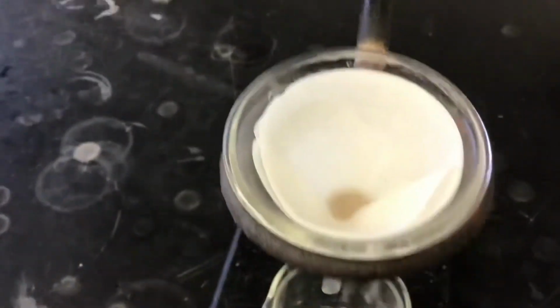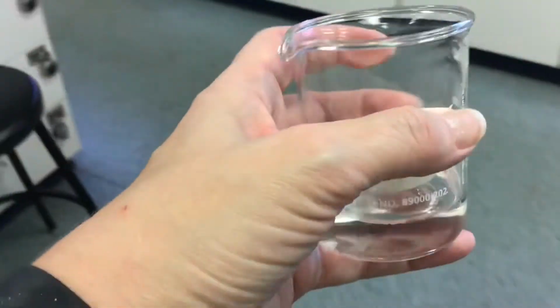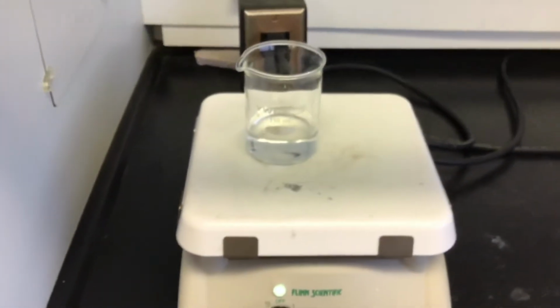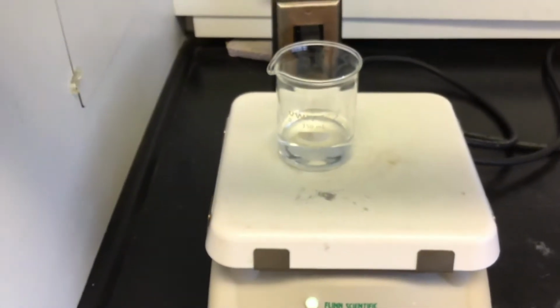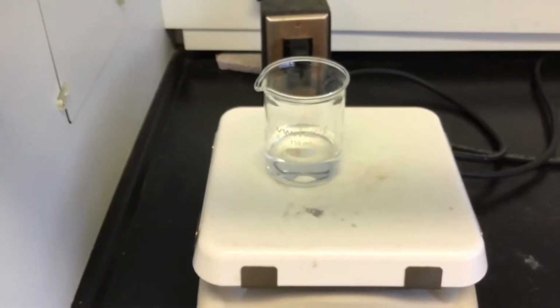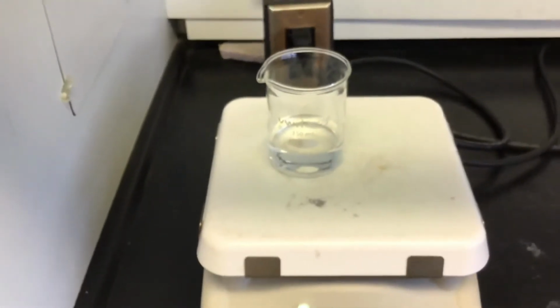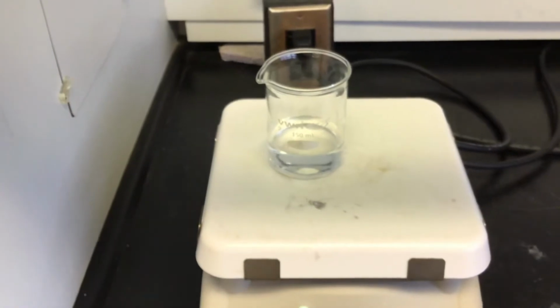Okay, so first thing I'm going to do is take this salt water, alright, and I'm just going to take this beaker right here, and then I'm going to walk over here back to my hot plate, and I'm going to stick that salt water on that hot plate. Okay, and I'm going to wait for the water to evaporate, and then I should just have my salt left. Okay, so it's just a waiting game with that one.